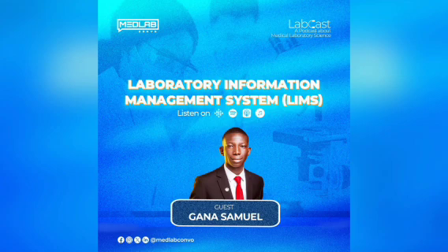All right, so Laboratory Information Management System, or LIMS as we call it, is a software that helps us as scientists manage samples and everything that's associated with samples, from sample collection, the analysis that is done on the sample, the results that are obtained, then what happens in the end, all the downstream applications that we do to the sample until it gets to the patient or the clinician. This is what LIMS looks after. This is what it automates.